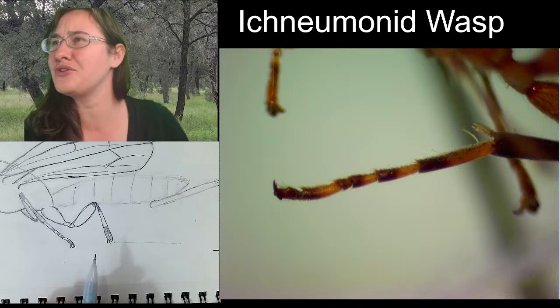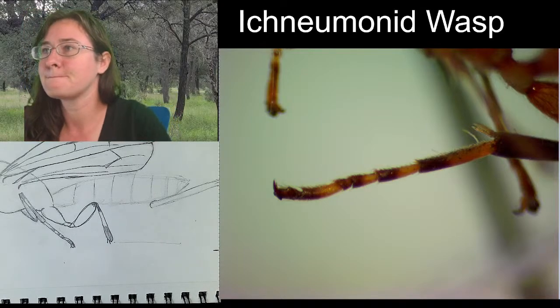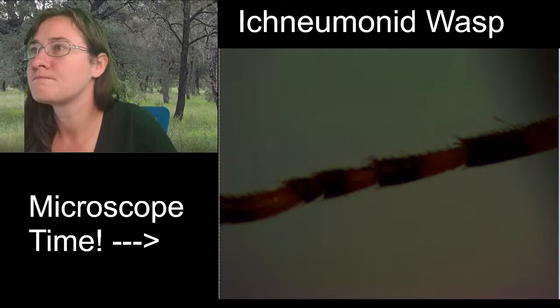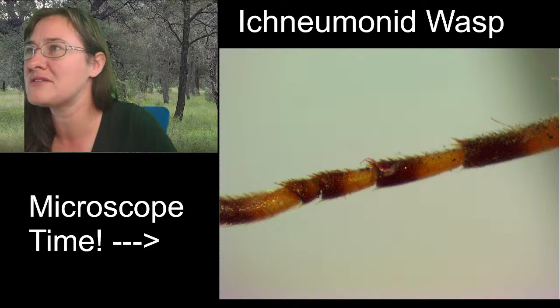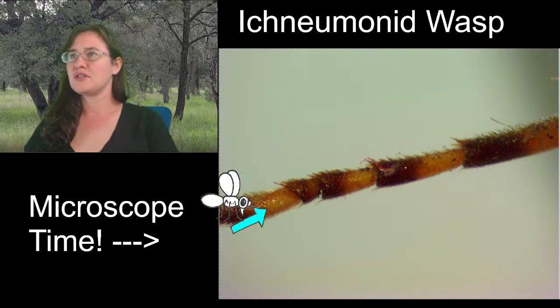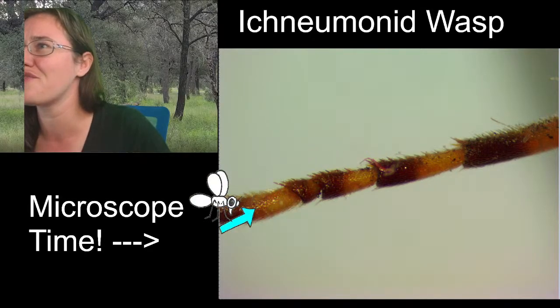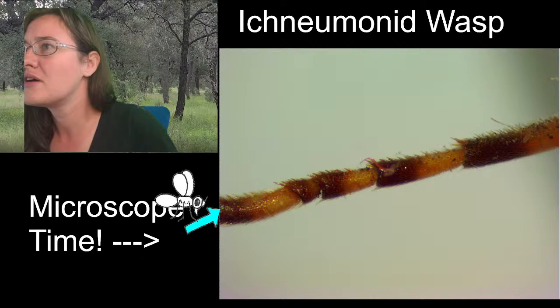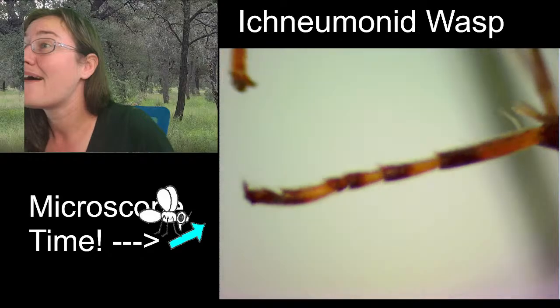It has 1, 2, 3, 4 tarsal claws. It almost makes me want to say that it has 5. What is that? Is it possible that it has 5 tarsal segments? Do you see this? 1, 2, 3. Is that a little 4? I think it might be.